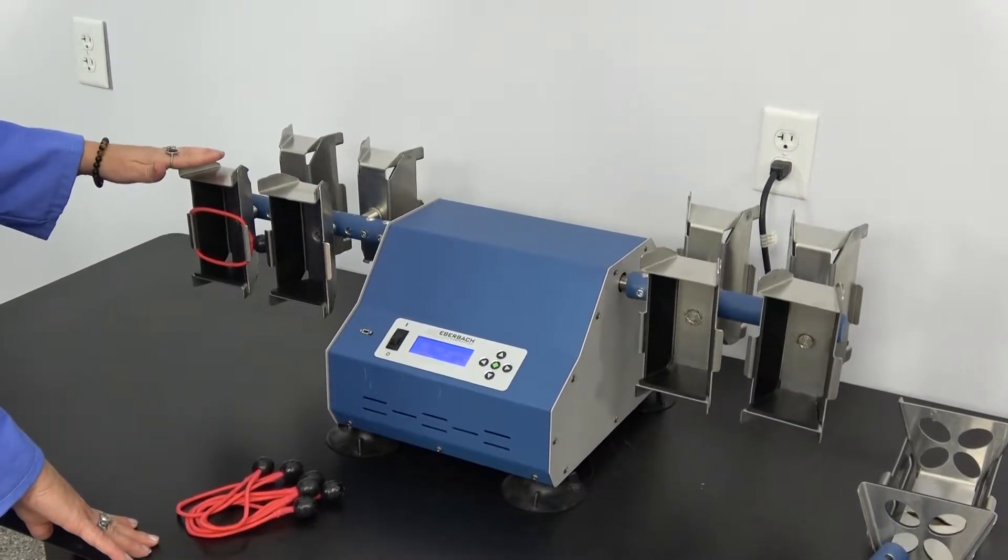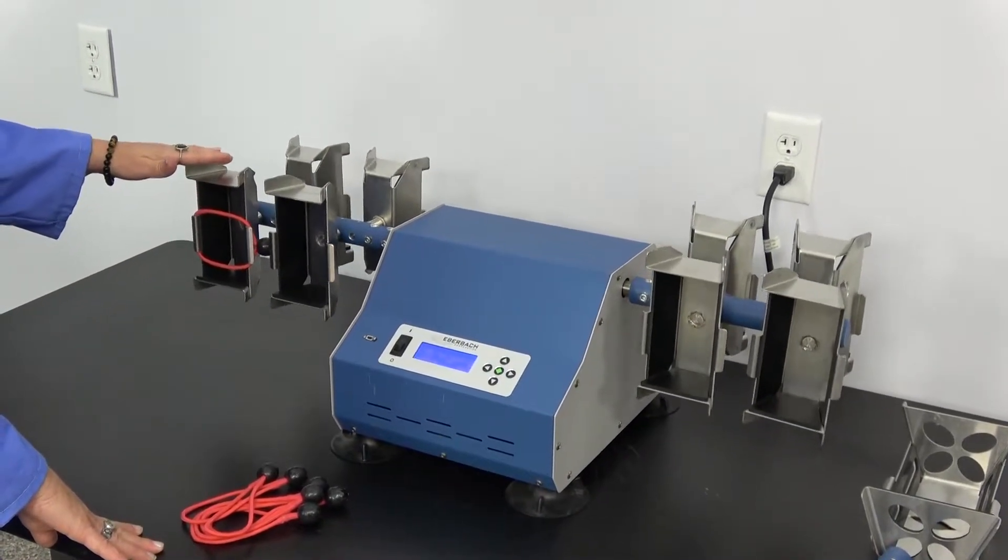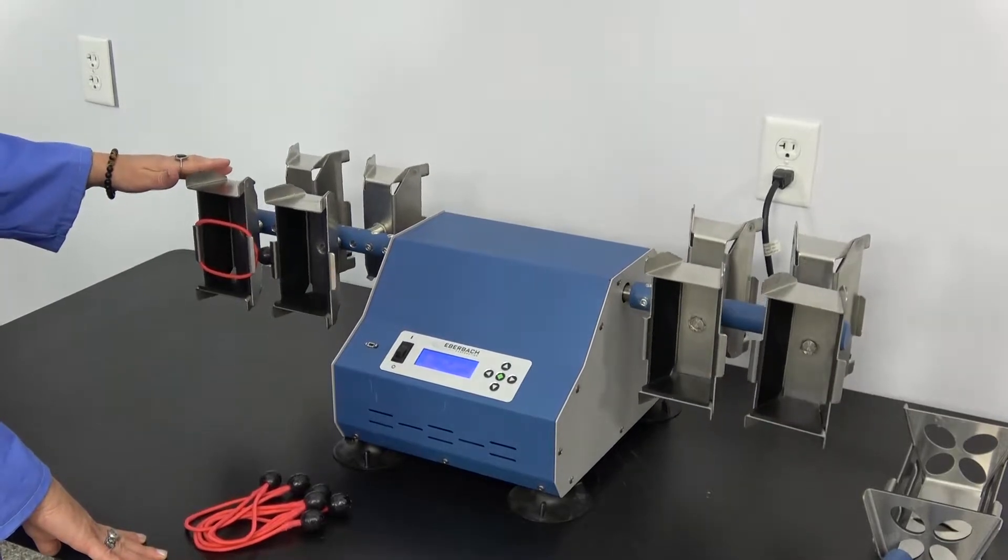This is, of course, at 100 oscillations per minute, so this is the slowest speed that it is set for.